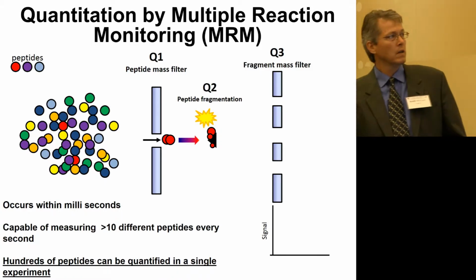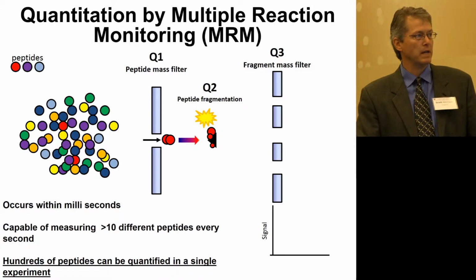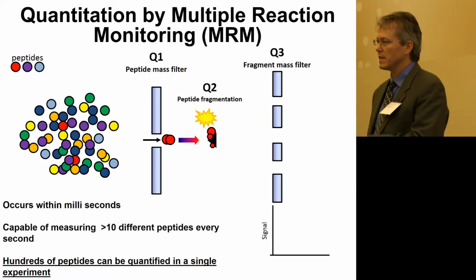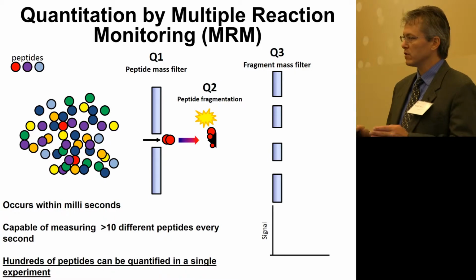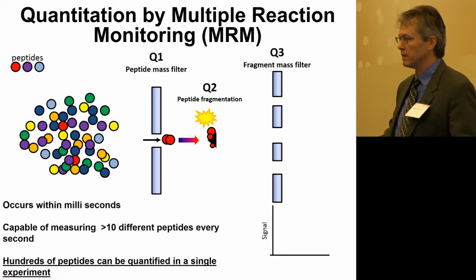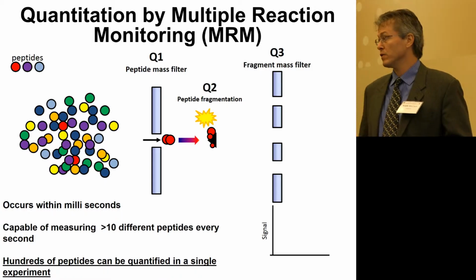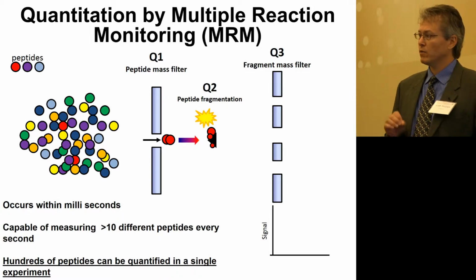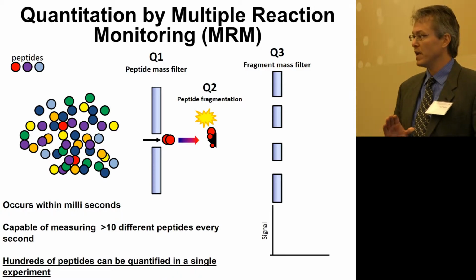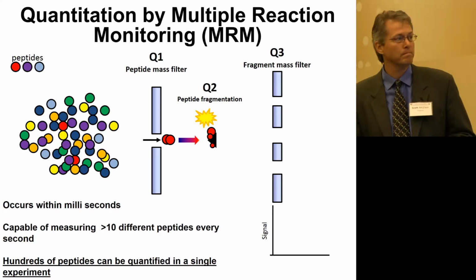Oh, okay. So if these are your targeted peptides here, they're in a complex matrix, and so where they start is they take seeds, grind them up, and they're going to do alcohol-based extraction of all the proteins present. You don't want to selectively leave proteins behind if you can help it. They've done a lot of work in standardizing that part. You heard this morning how important that can be. With the soybean work in particular, they worked really hard and they actually published on nothing but how to extract total protein from seed because it's so important.